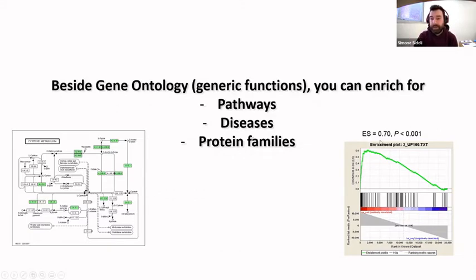Here on the right is GSEA, developed by the Broad Institute in Boston, and this one instead is a software to look at what is functionally enriched in terms of a lot of properties, but is mostly focused on patterns that are related to specific diseases. So depending on your question, it might not be what is the molecular function of my enriched proteins, it could be what pathway they belong to. You can use a software that is more specific for that question.